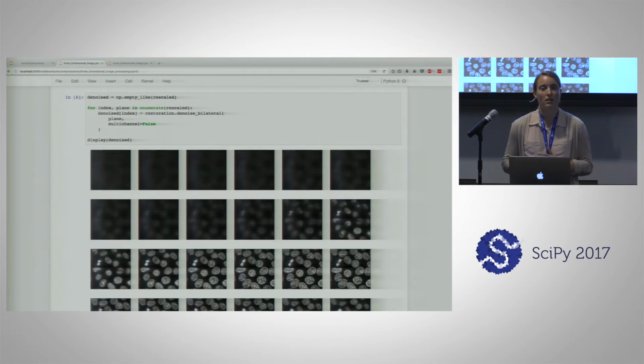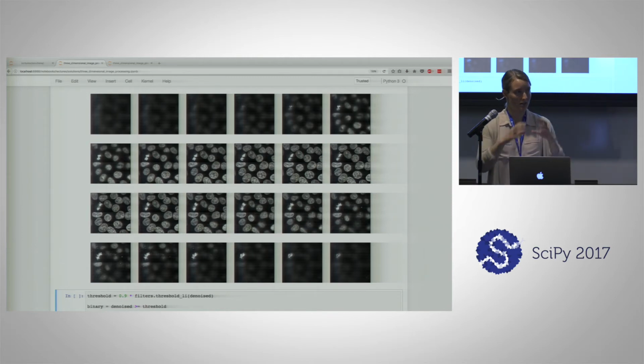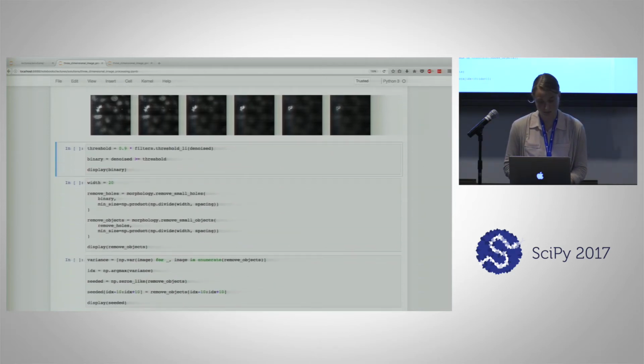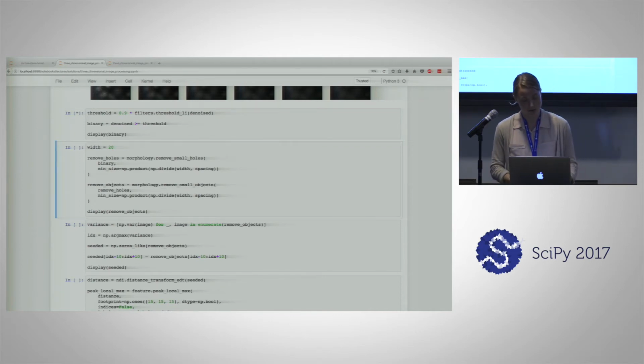I reckon that the over-segmented cells were caused by this pinch pointing in the row or column dimensions that we weren't observing, and I thought that if I perhaps gave it a more generous threshold, we would get smoother cells, or a smoother binary representation of those cells, in the planes where they start to disappear into their murky cell juice abyss. I'm not a biologist, so I don't know the real words for that.